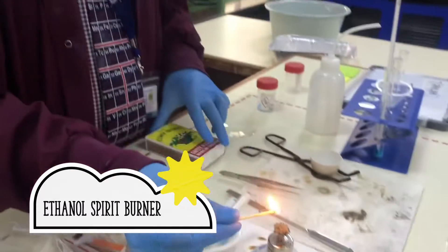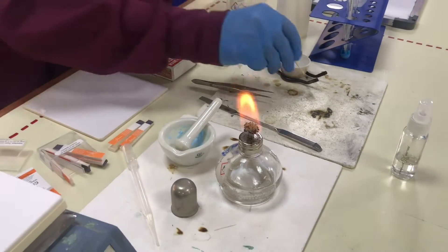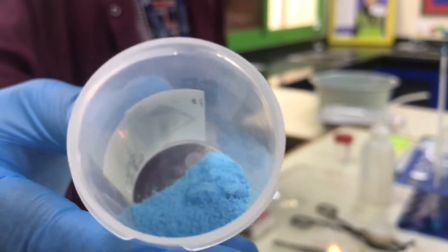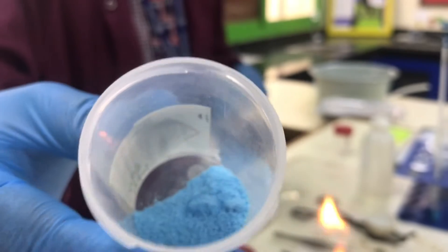We're going to utilize the help of a spirit burner. This is a spirit burner, it's just burning some ethanol. I've got some copper 2 sulfate. This is hydrated copper 2 sulfate, you can see that it's blue.